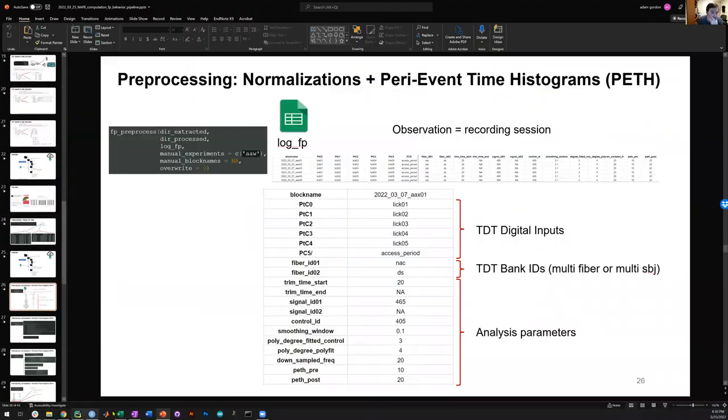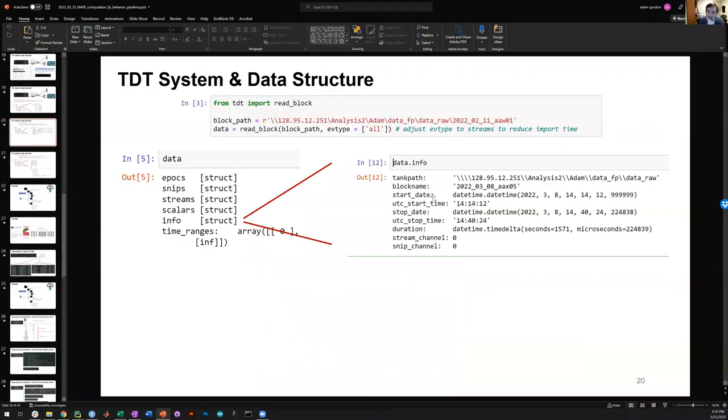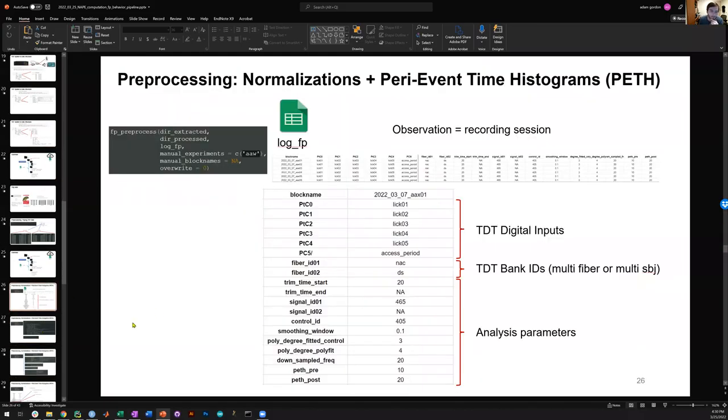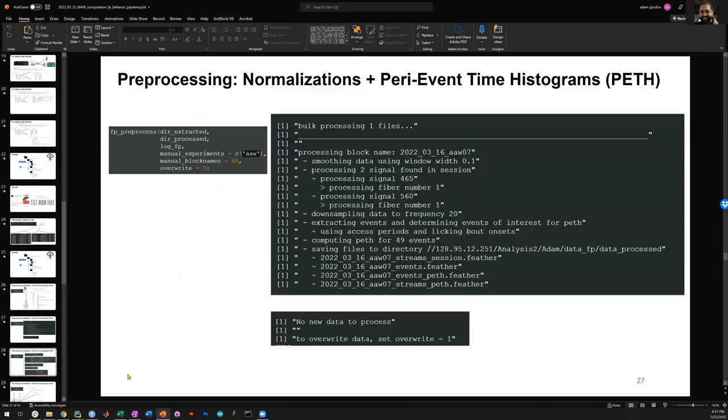So I guess one option is, if you look inside the streams, it specifies what the sampling rate is. So if you just want to keep the maximum, you could just feed this in, or you could feed in an NA for the downsampling. I haven't programmed that in, but you could do that. You could just set this to NA and then it won't downsample, or you can set it to an arbitrarily high frequency. I'm not sure, but I think the easiest way would be to not downsample at that point. Right, okay, thanks.